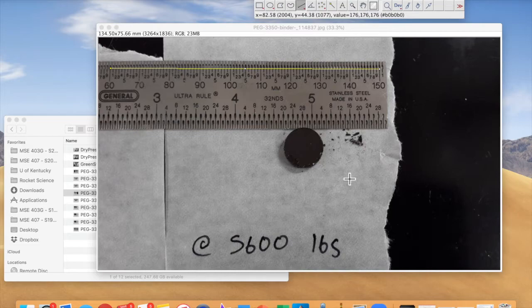So I've set the scale, and now I'm going to take some measurements. So I've got the image open here, and here's the pellet that I want to measure, for example, the diameter, right? That way I could calculate the volume of it. So a couple other things that we'll want to know about ImageJ that might help us. You can see that the pellet is rather small in the image, and so we might want to blow it up or zoom in.